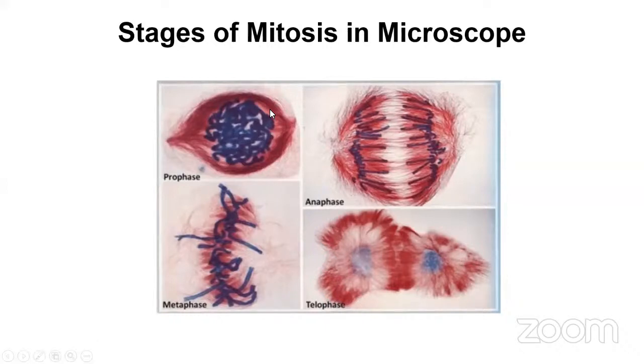In the video there was a small problem: first they were showing the staining with acetocarmine, and then at the end stage they were showing water. So that was the problem. Water washing will be done at the beginning, and the treatment with hydrochloric acid 0.1 normal and then acetocarmine will be done at the later stages, and you will observe under the microscope only after you have put the acetocarmine stain. And hydrochloric acid is used because it helps in the better staining of the chromosomes once acetocarmine is added.